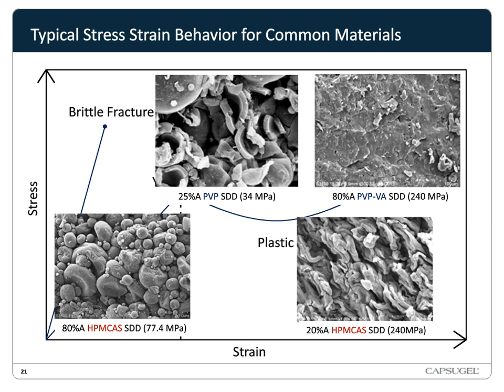And so we can reduce scale-up risks and optimally reduce the tablet size by knowing the SDD mechanism of deformation and formulating the tablet around its strengths and weaknesses. In the following slides, we'll show two case studies, one whose primary mechanism of deformation is brittle fracture, and the other plastic deformation.